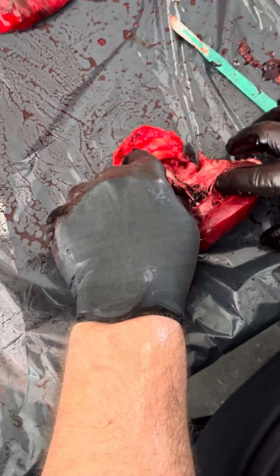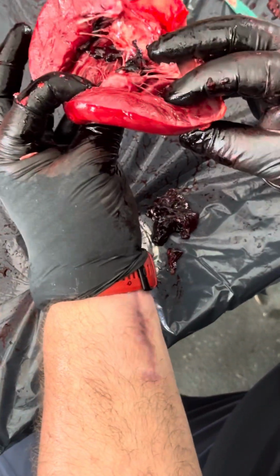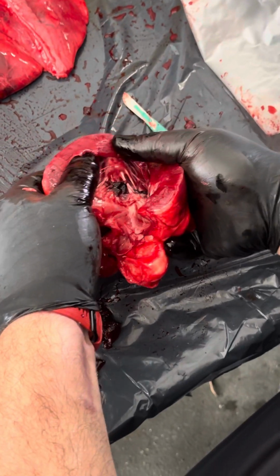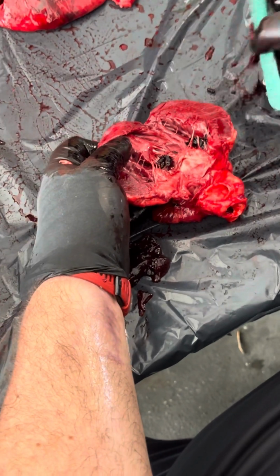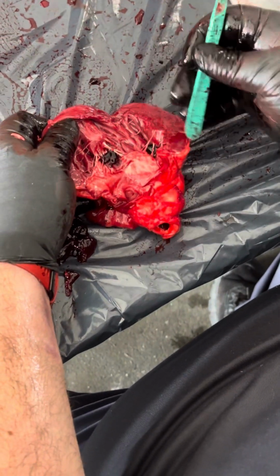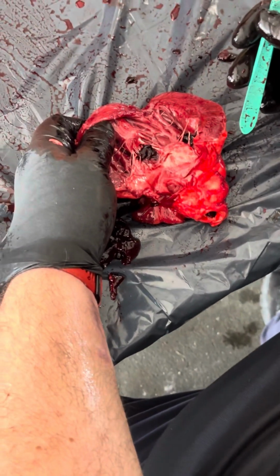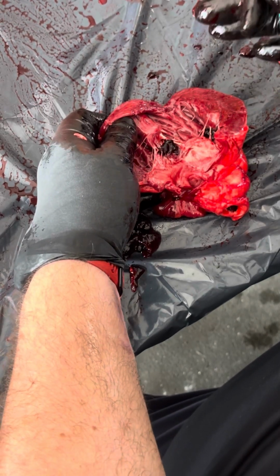There's your two leaflets, 1 and 2. The thickness of the left ventricle in comparison to the thickness of the right. The right side, left side. So this is the workhorse. All these papillary muscles, all these chordae tendineae holding your leaflets. If there's damage to those, that's how you get mitral valve and tricuspid valve prolapse, which causes regurgitation, which causes congestive heart failure.